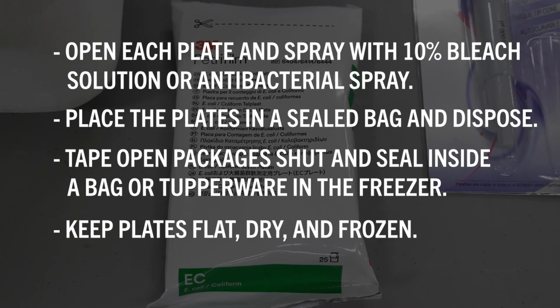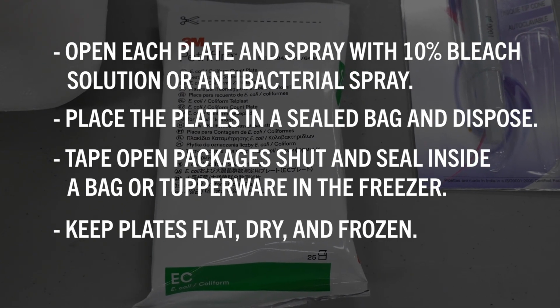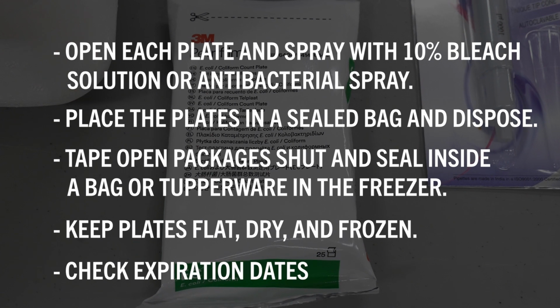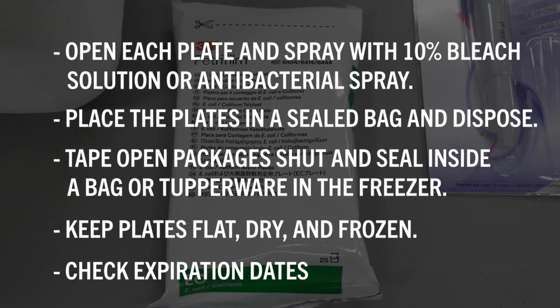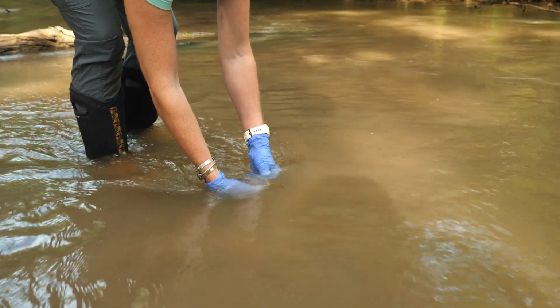Be extra careful during transport to keep plates flat, dry, and frozen when letting others use your kit. Check expiration dates on the back of each packet prior to each use. Monitoring for bacteria should be done monthly.